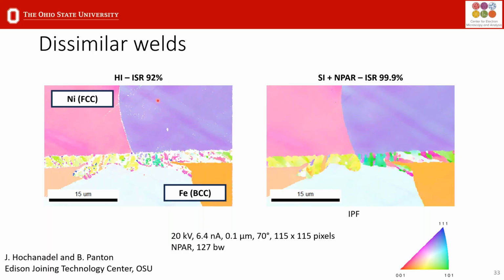During this high temperature process, the molten nickel will diffuse into the iron, and at high temperature it will form austenite in the iron. Upon cooling, this austenite will then convert to martensite, and it will form a very fine lath structure right here at the interface between the filler material and the solid substrate. In this project, they are very interested in analyzing the orientation relationships.